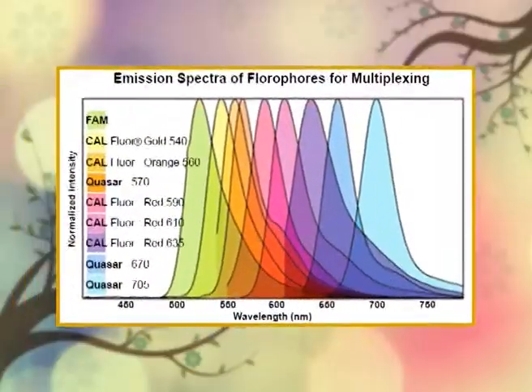Therefore, fluorescence spectra are band spectra that are usually independent of the wavelength of radiation absorbed. Thus, each molecule or substructure that is able to emit fluorescence, called a fluorophore, exhibits its own fluorescence properties.